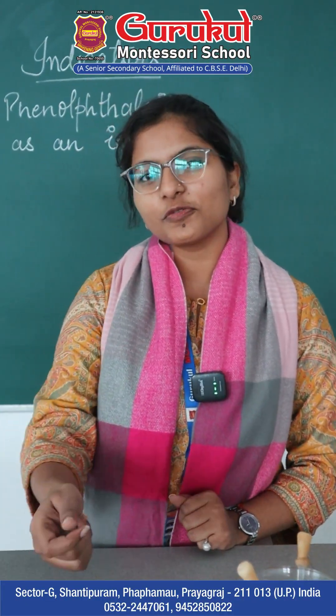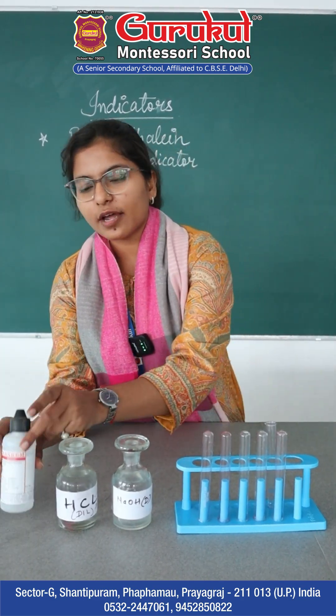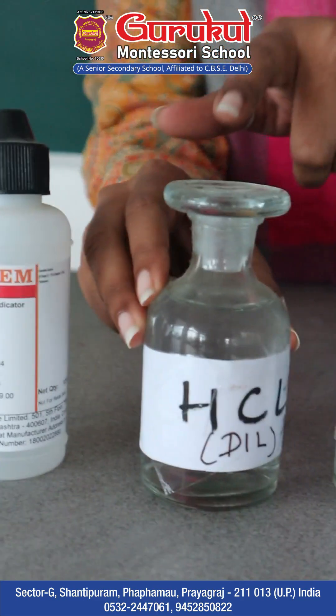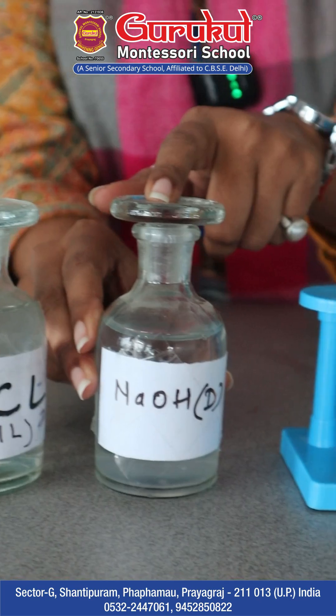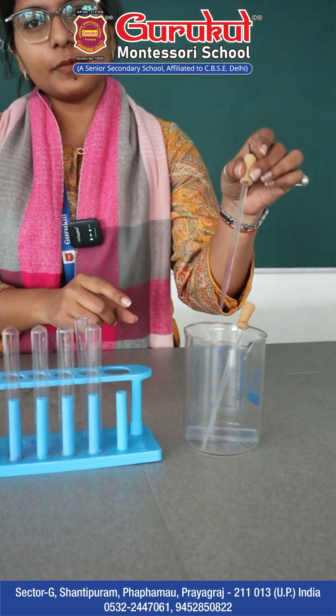Good morning all. I'm Dipanshi Verma from Gurukul Montessori School, here to show you phenolphthalein as an indicator. The materials required for this experiment are phenolphthalein as an indicator, HCl as an acid, NaOH as a base, a set of test tubes, and droppers.